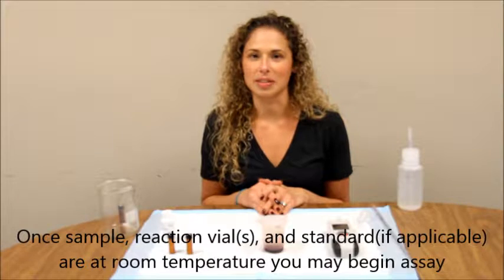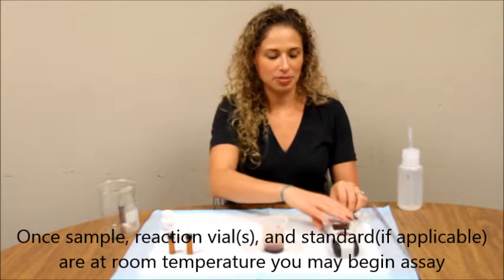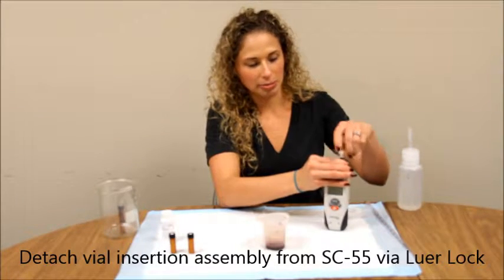Make sure your wine sample, standard, and reaction vials are all at room temperature before beginning. First, detach your vial insertion assembly from your SC55 by unscrewing from the lure lock.